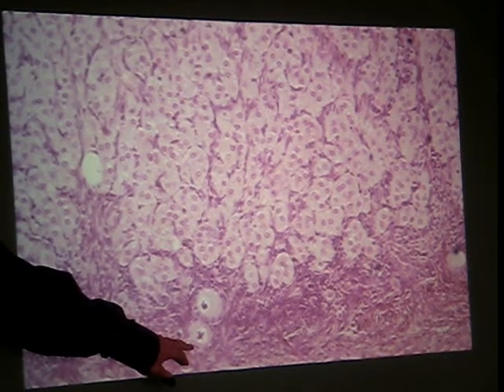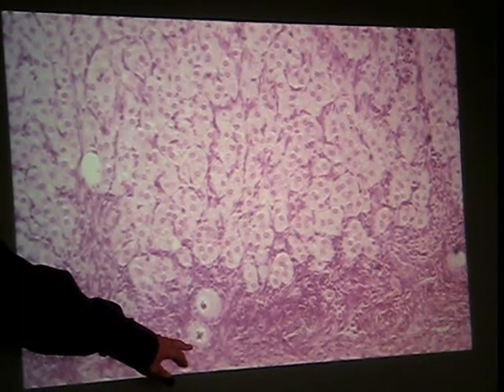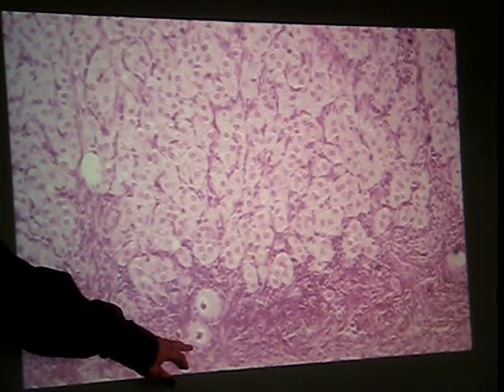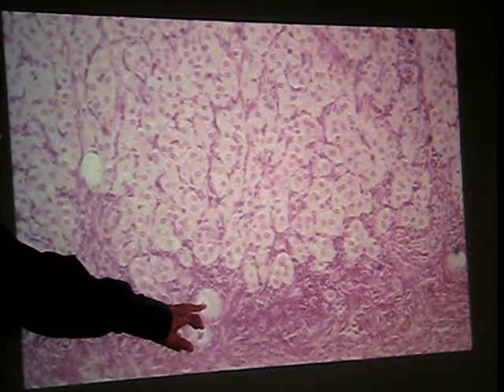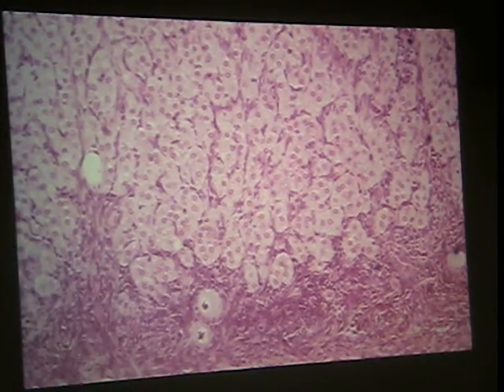This one right here. Say it so I can hear it. It's not that you're wrong. Primordial, right? And this one would be primary. Exactly.